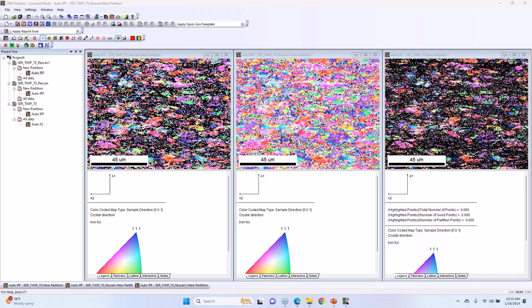And between etching and electropolishing, there's some work to get the parameters right to get a non-pitted, polished surface rather than a strongly etched surface.